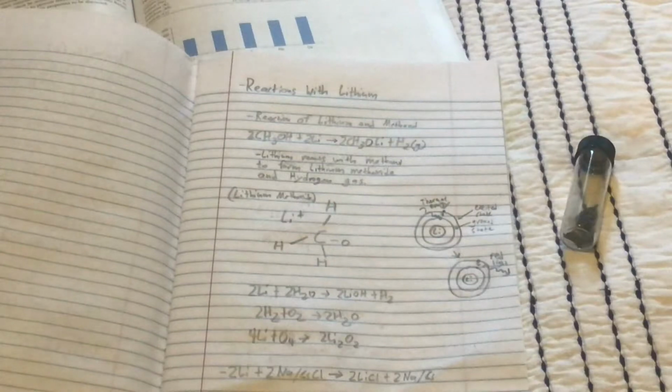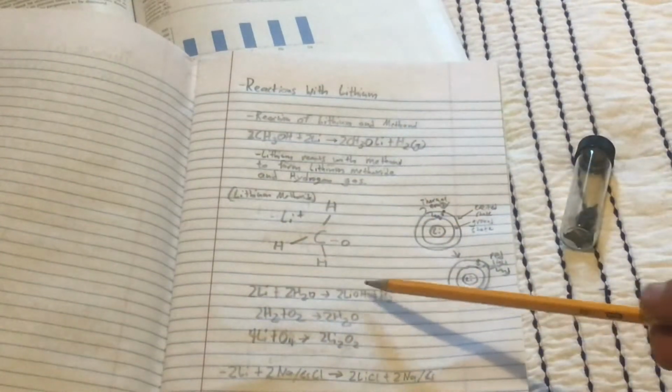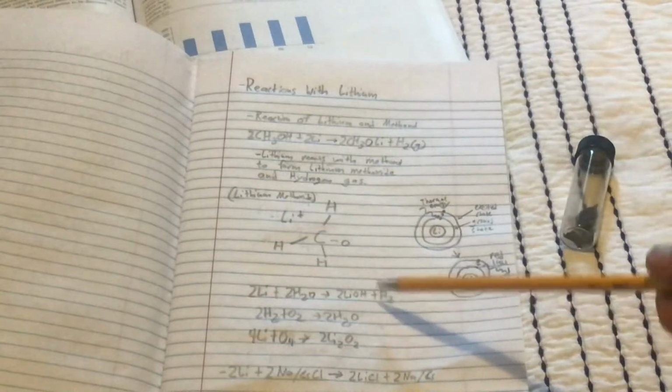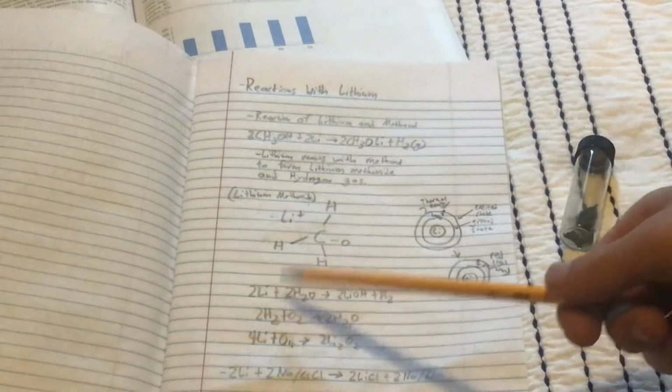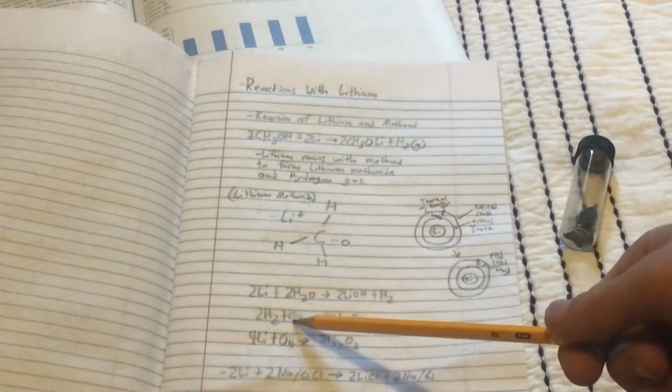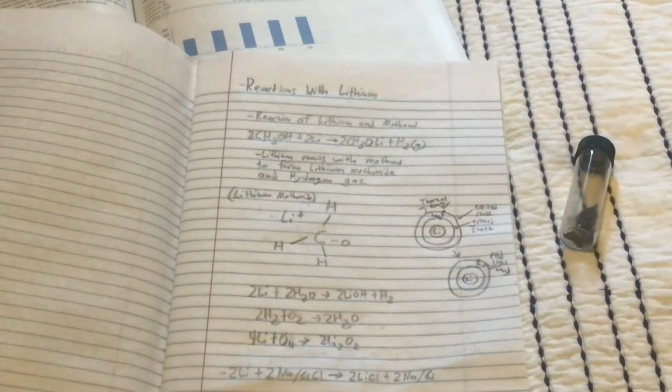Well, just like any other alkali element, we can simply react it with water to form hydrogen gas and lithium hydroxide. Then, if enough friction is generated in this reaction, the hydrogen gas will spontaneously combust, reacting with oxygen to form water vapor. Now, let's go do that. Oh wow, look.